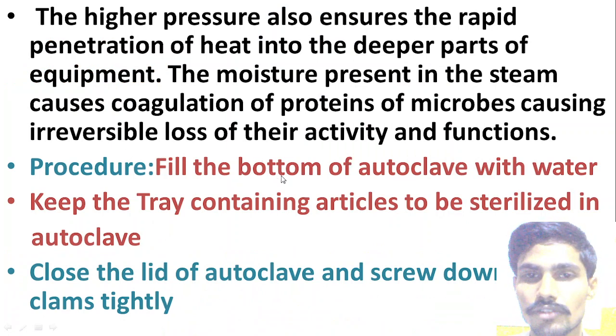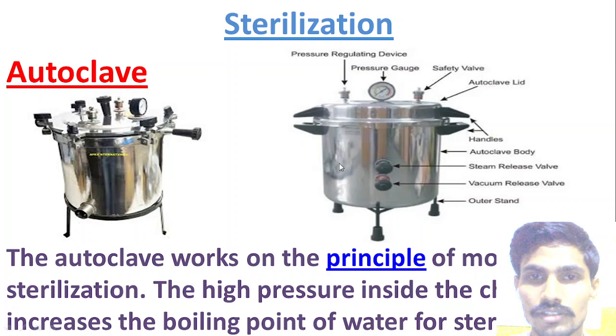Initially fill the bottom of the autoclave with water. This is the autoclave. Remove the lid clamp, and fill the bottom of the autoclave with water.